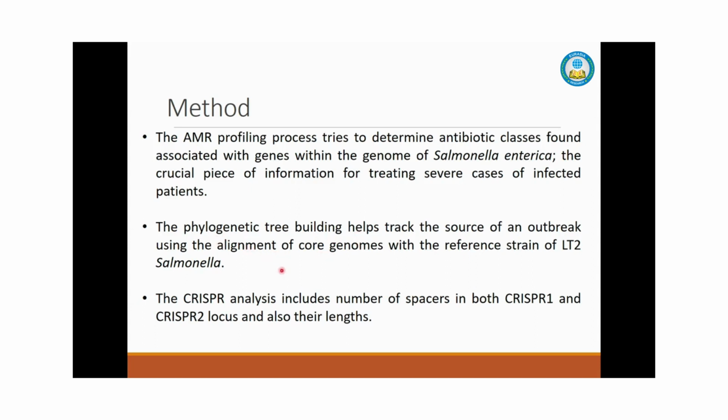This is useful because it can pinpoint the exact strains that caused the outbreak event. So professionals can quickly go to that source and eliminate it, maybe the animals or maybe the plants, such as onions or tomatoes, that are the source of the outbreaks.